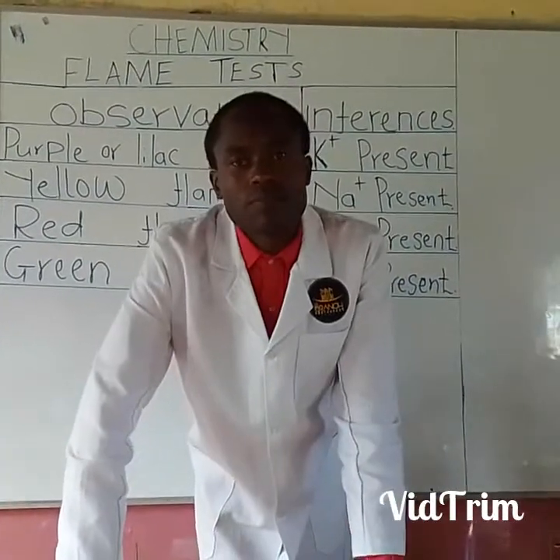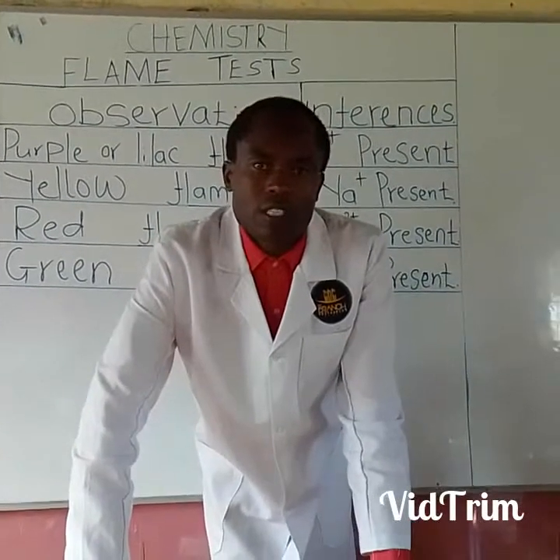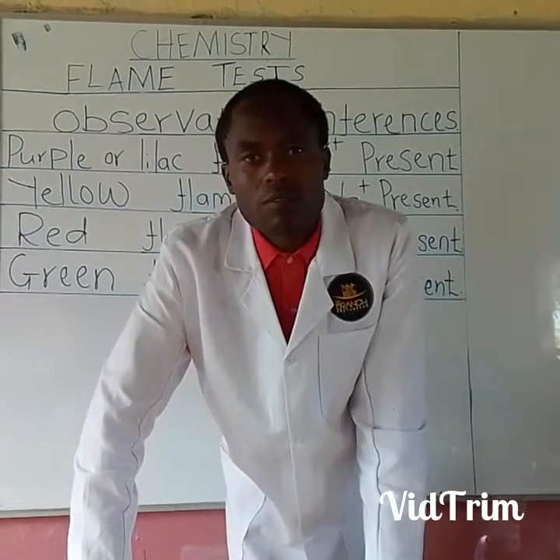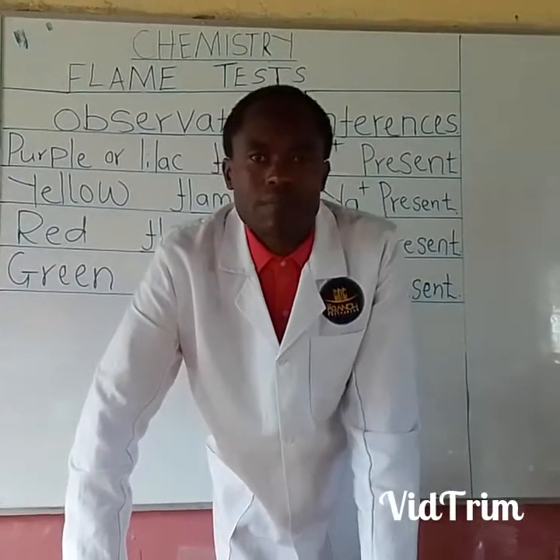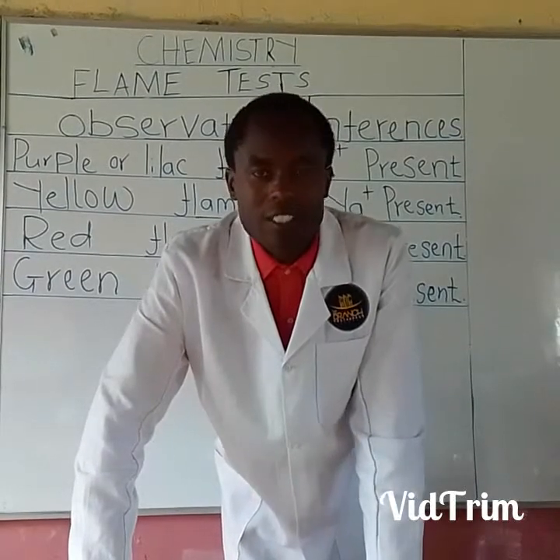My student, welcome to a chemistry lesson. What are we going to discuss in this lesson? We are going to discuss flame tests, flame tests of some ions, especially the cations.